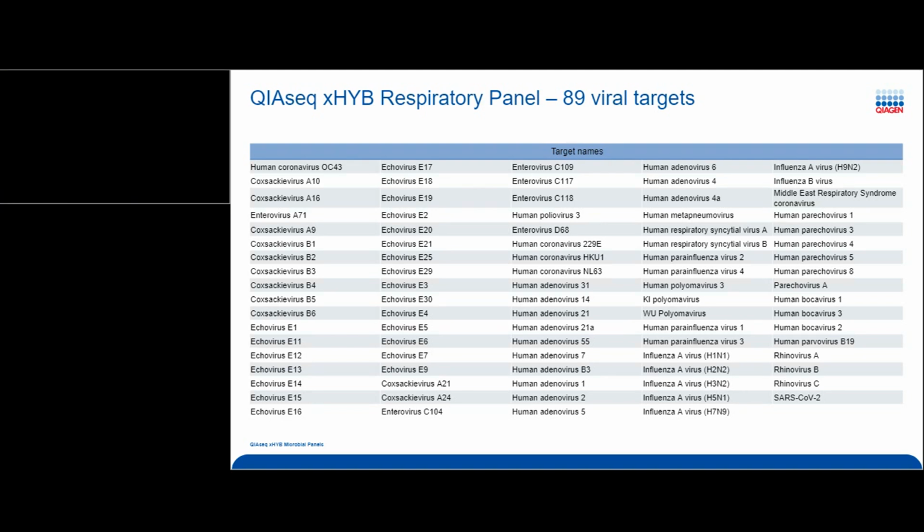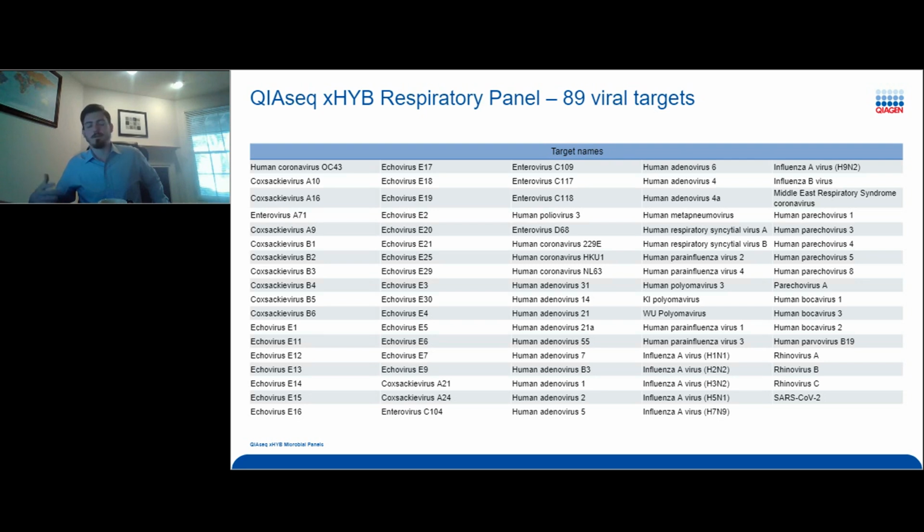Do you recommend any differential pre-treatment for different samples, such as blood versus feces, to be used for the kit? Again, the sample prep kit really is the important thing there. For anything that is more difficult for NGS and PCR in general, I would recommend one of QIAGEN's kits that have power in the name because it has the inhibitor removal technology.